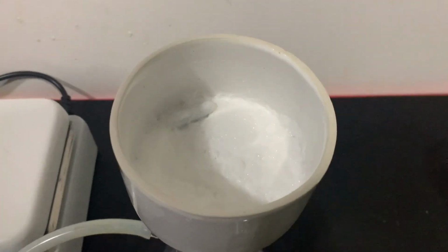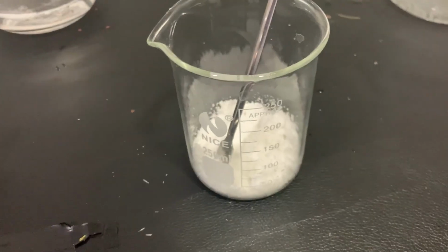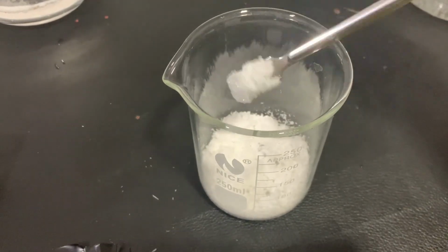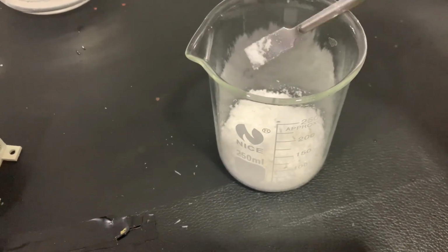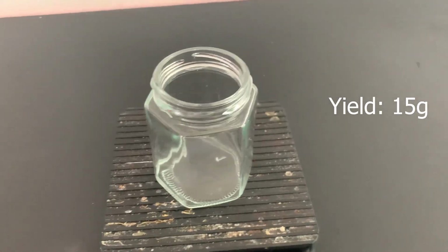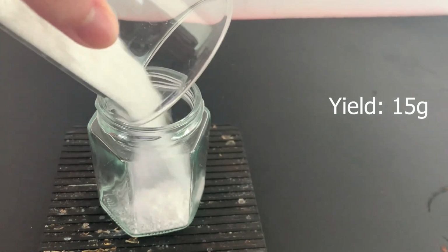I did another vacuum filtration to separate the now purer phthalimide. I transferred all of the wet phthalimide to a beaker and dried it in the oven. Once it is dry, I measured the amount of phthalimide I got and it was 15 grams.